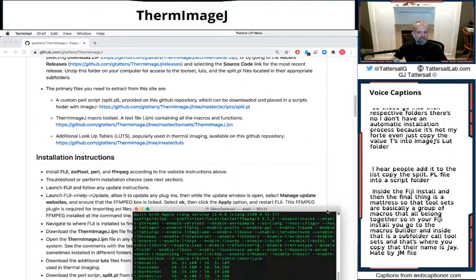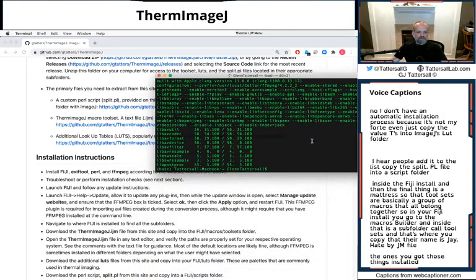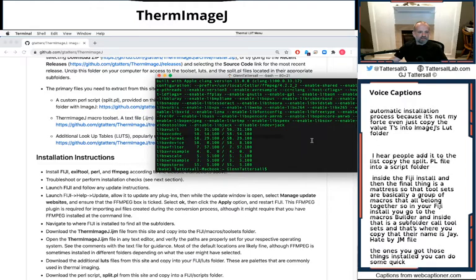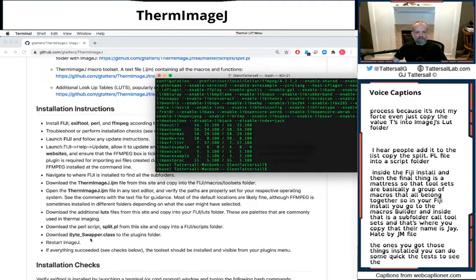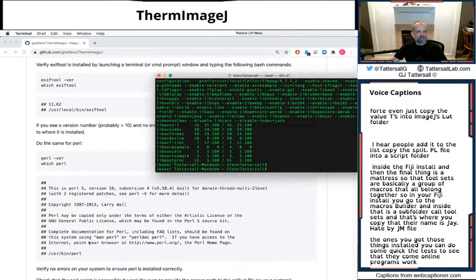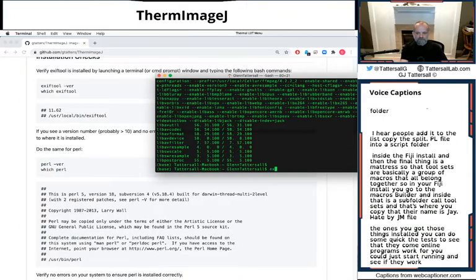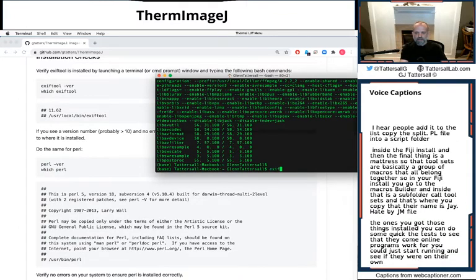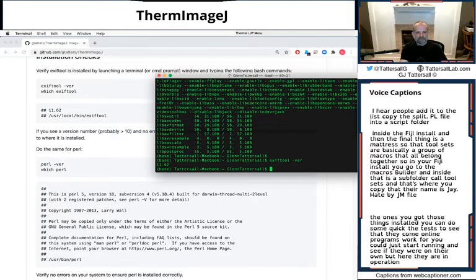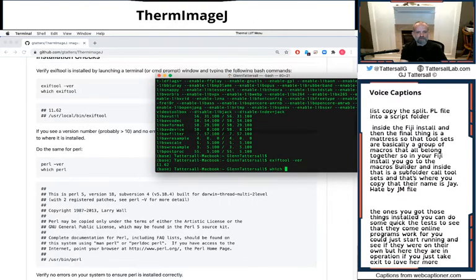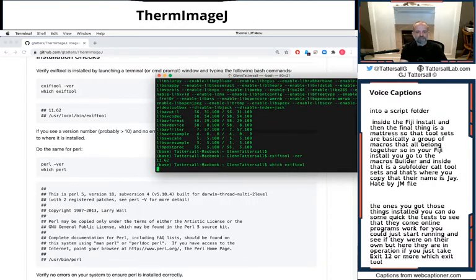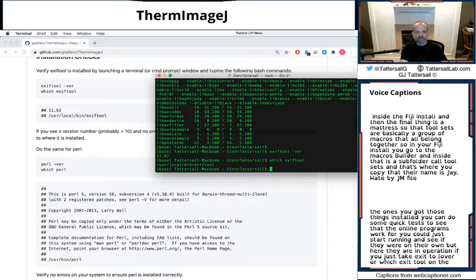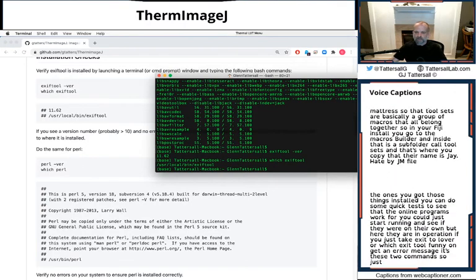Once you've got those things installed, you can do some quick tests to see that the command-line programs work, or you could just start running and see if they work on their own. But here they are in operation. You can just type exiftool -ver or which exiftool. As long as you don't get an error message, these two commands suggest that it's installed properly.